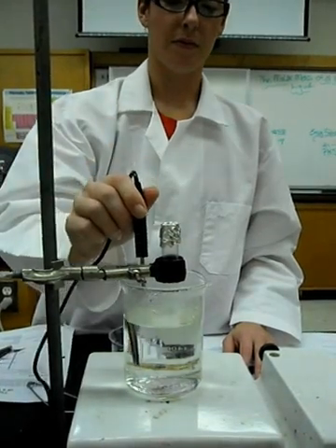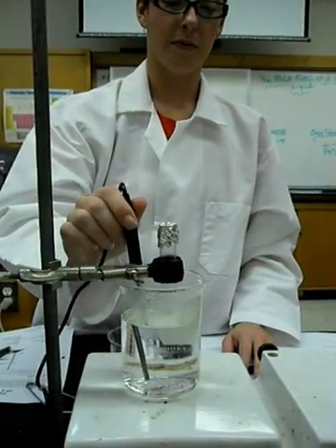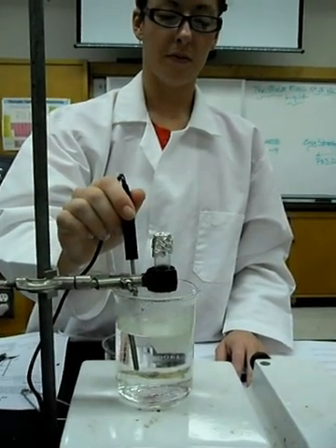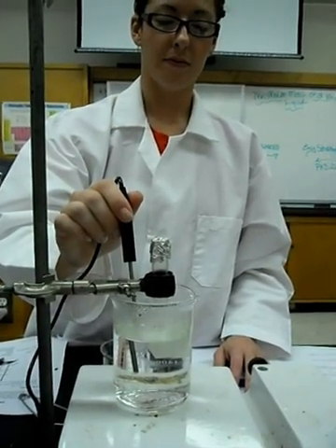Immerse the temperature probe in the hot water bath as shown. Do not allow the tip of the probe to touch the beaker. This will give you a more accurate reading of the water bath temperature.